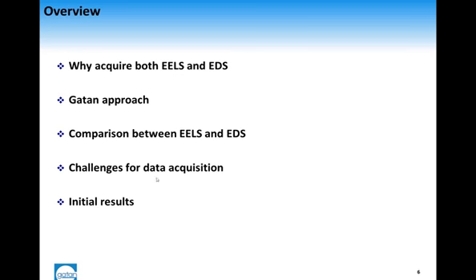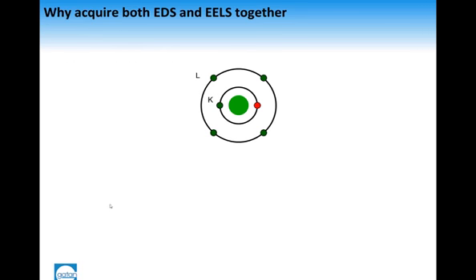So this is the overview of this presentation. Basically, we'll start off describing why we want to acquire both EELS and EDS. We're going to show the Gatan approach, so how we acquire both techniques. We're going to compare the two techniques, show some challenges for data acquisition, and also show some initial results.